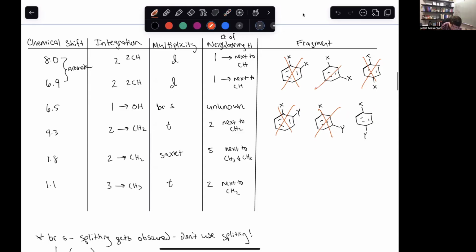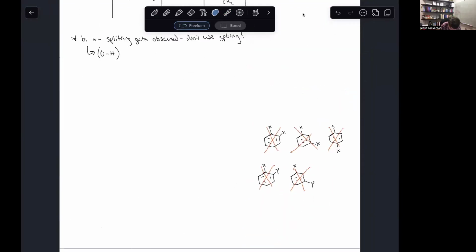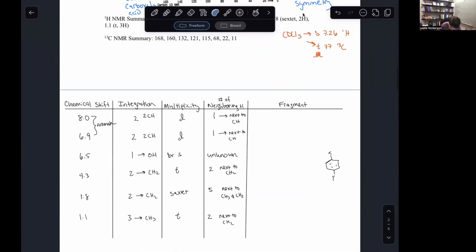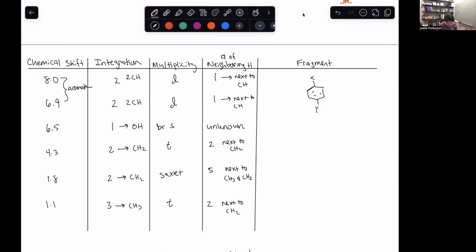So that is going to help us get to the full elimination process there, where I'm just going to move these off to the side. Okay, where we get to that single fragment for our benzene ring. Okay, without too much work, mostly just counting things. And it does take a little bit of practice to get used to knowing where your lines or cutoff points are. Okay, so that fragment is done.